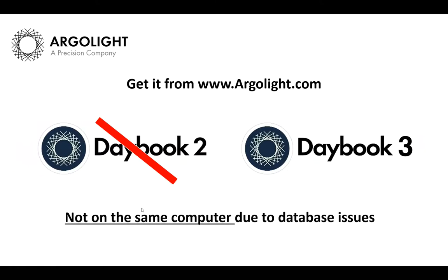You can get it from our website. It is still a free download. And this is the only way to get Daybook 3. You cannot update from within Daybook 2.